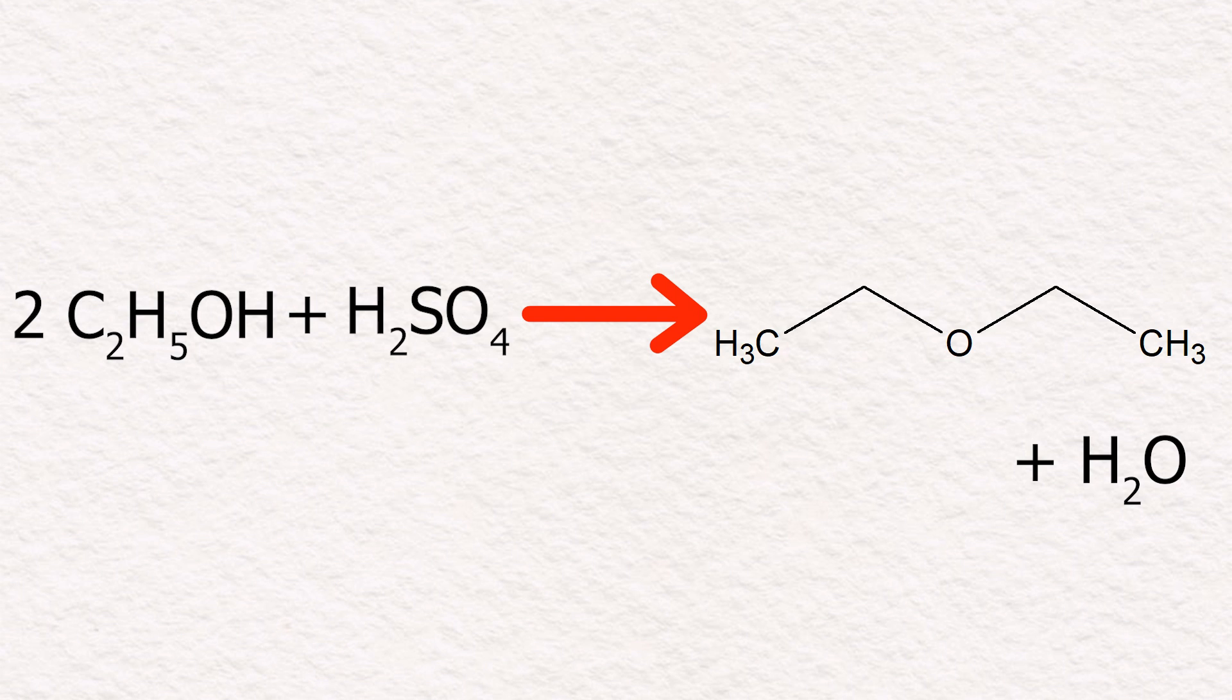In this video, I will be using ethanol and sulfuric acid to make diethyl ether. Diethyl ether is a very useful solvent for many applications, and I will be using it to make Grignard reagents, which can only be done in anhydrous diethyl ether.